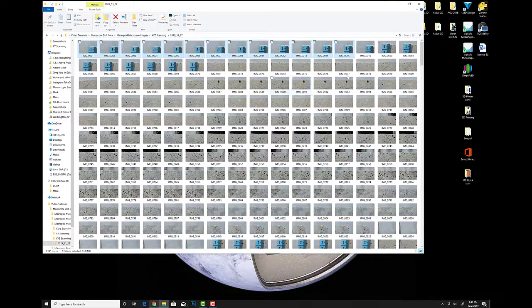stitching video. And again, the reason why I'm deleting all these is these were probably test shots, and then we actually started the imaging process, so it captured 8 images plus our test shots. But the reason why I'm deleting them is we really just don't need them, because you can see that all the information in this frame is visible in the next frame. So why stack it when it's already going to be captured over here? So let's go ahead and delete all of those photos.